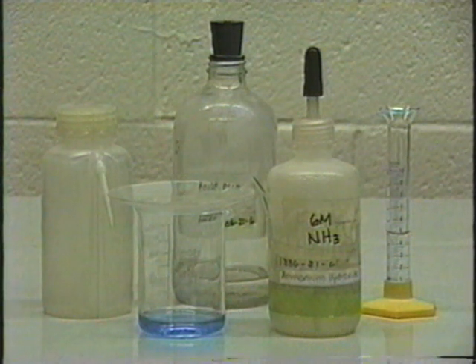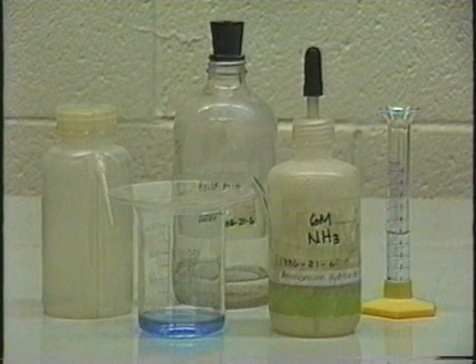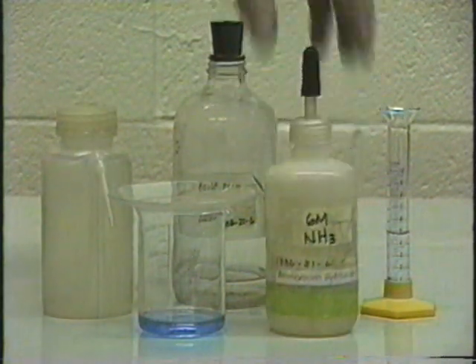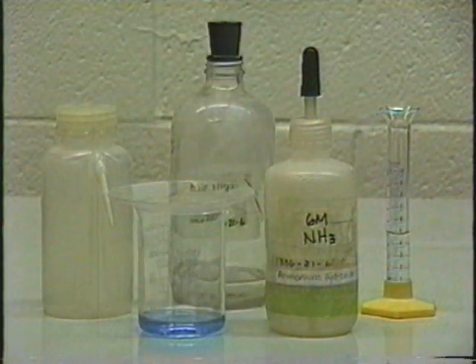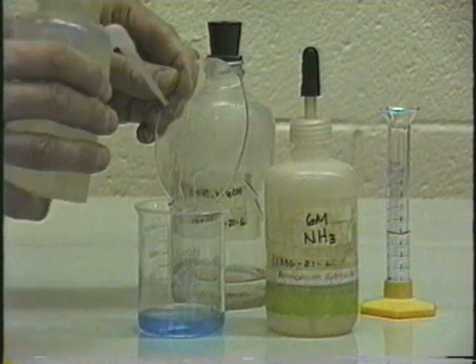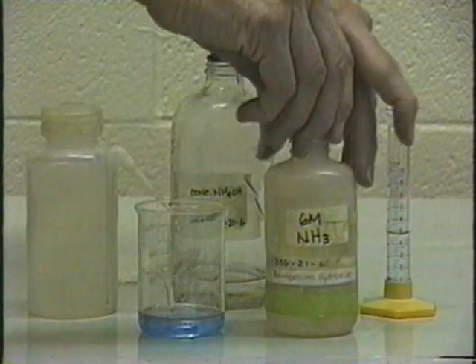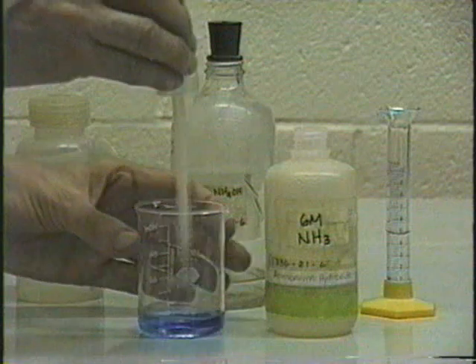Now, after your copper is completely dissolved, you'll want to add ammonia to intensify the color. You'll do that in two steps. First, you'll use 6 molar ammonia, then concentrated ammonia. Let's see how that's done. We'll start by rinsing off the watch glass so we don't lose any copper. Now we'll start adding the 6 molar ammonia here.